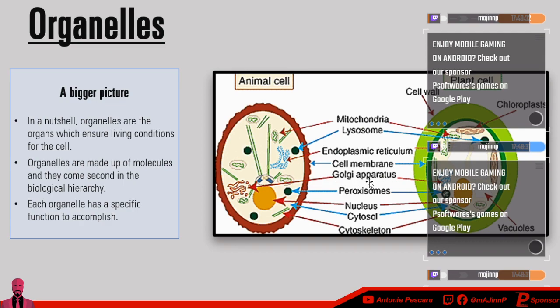So each organelle has a specific function to accomplish, and that's what makes the cell a living organism. That's what makes both cells a living organism.